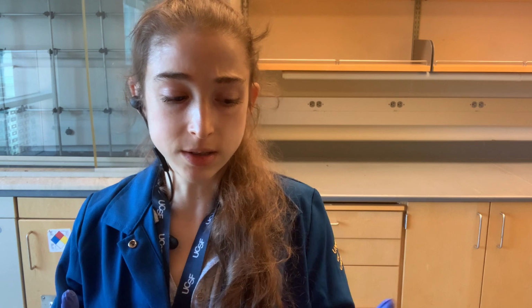So we have a variety of lab equipment that we can use for different purposes. What your purpose is going to dictate what you're using, as well as what's available is going to dictate what you're using. And yeah, just have fun experimenting and don't be intimidated by all the different equipment. It's all there to help. And remember that room temperature, who really knows?